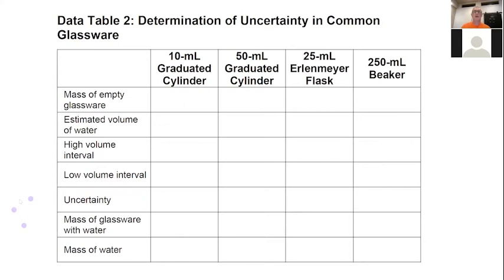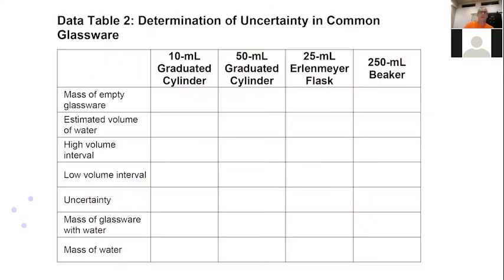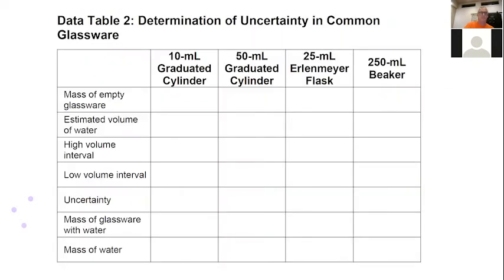There we go. Yeah, right. So for the glassware, here's where we put the empty. Here's where we put the empty masses. God, give me a break. I just love technology.